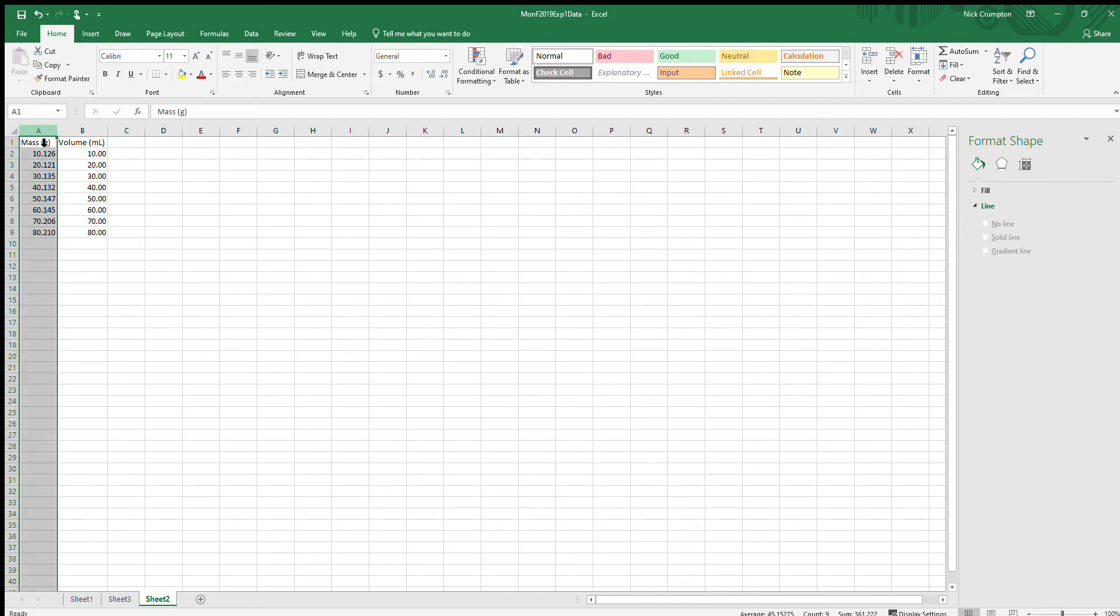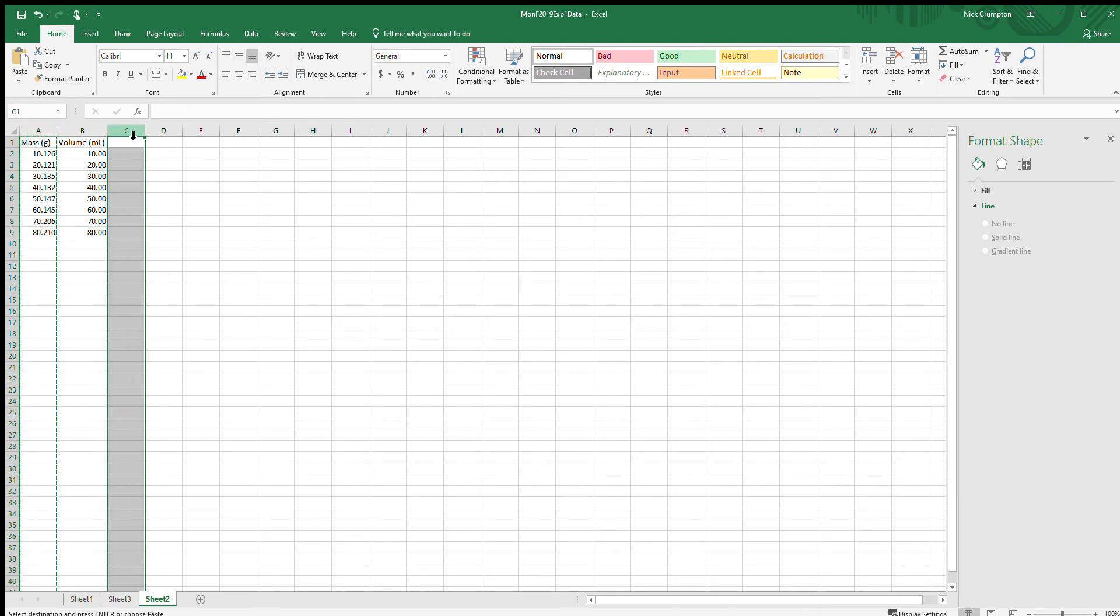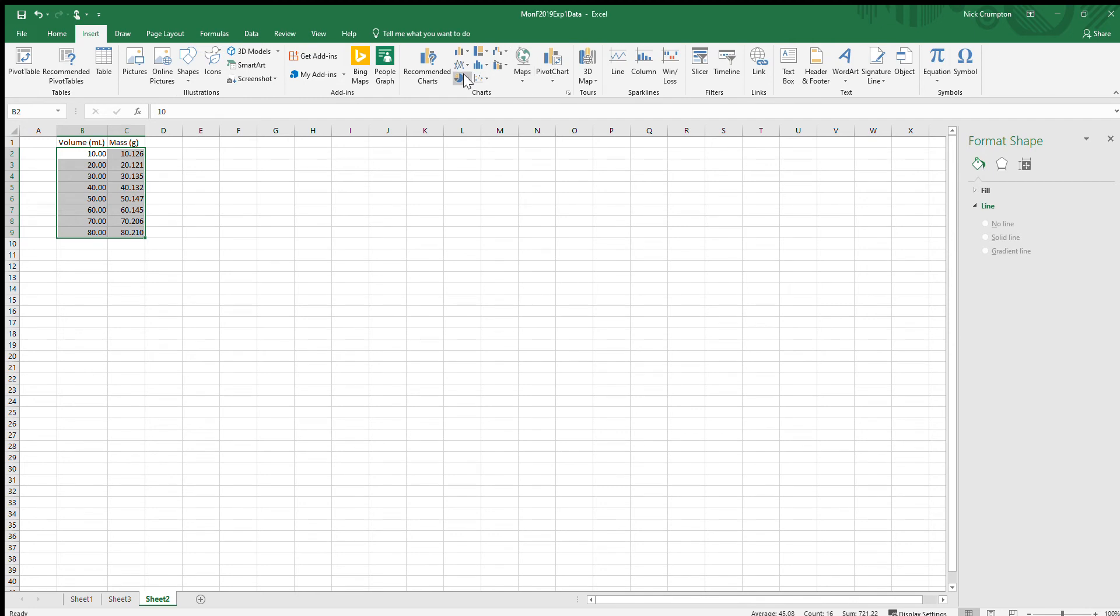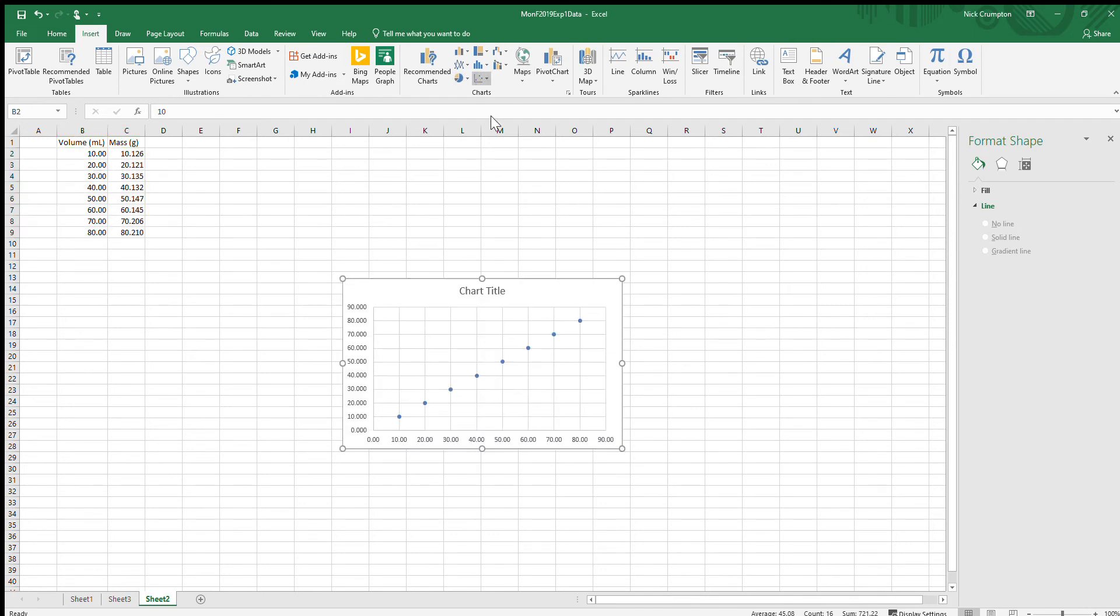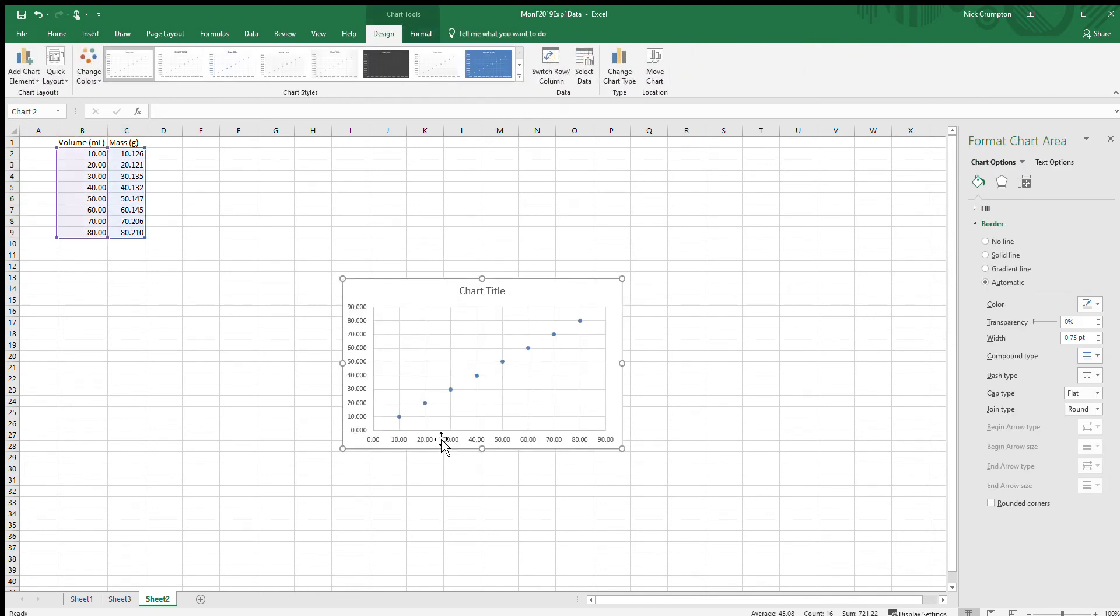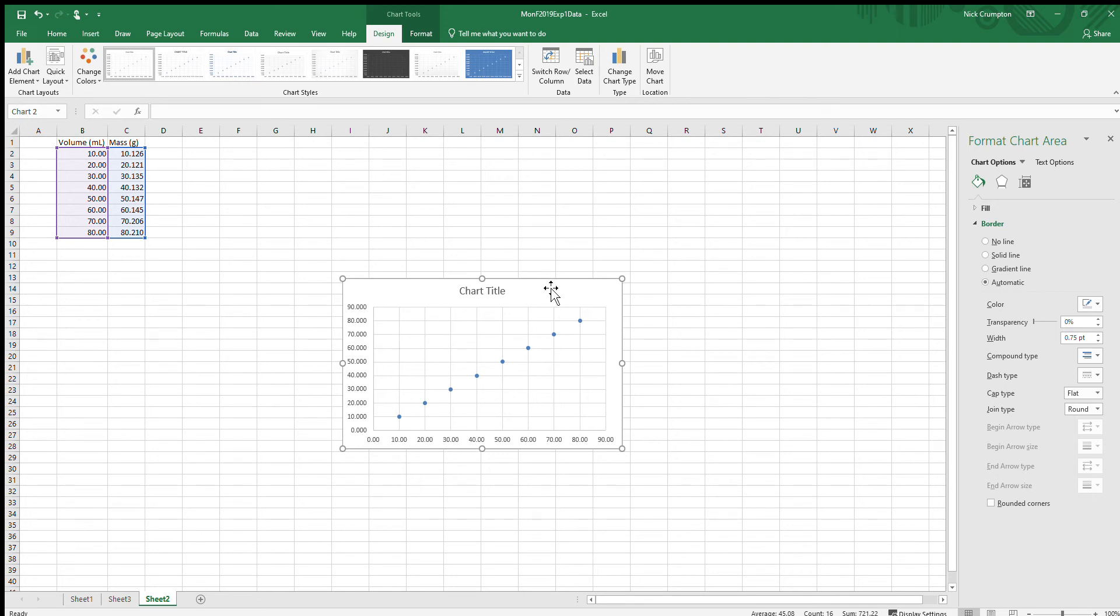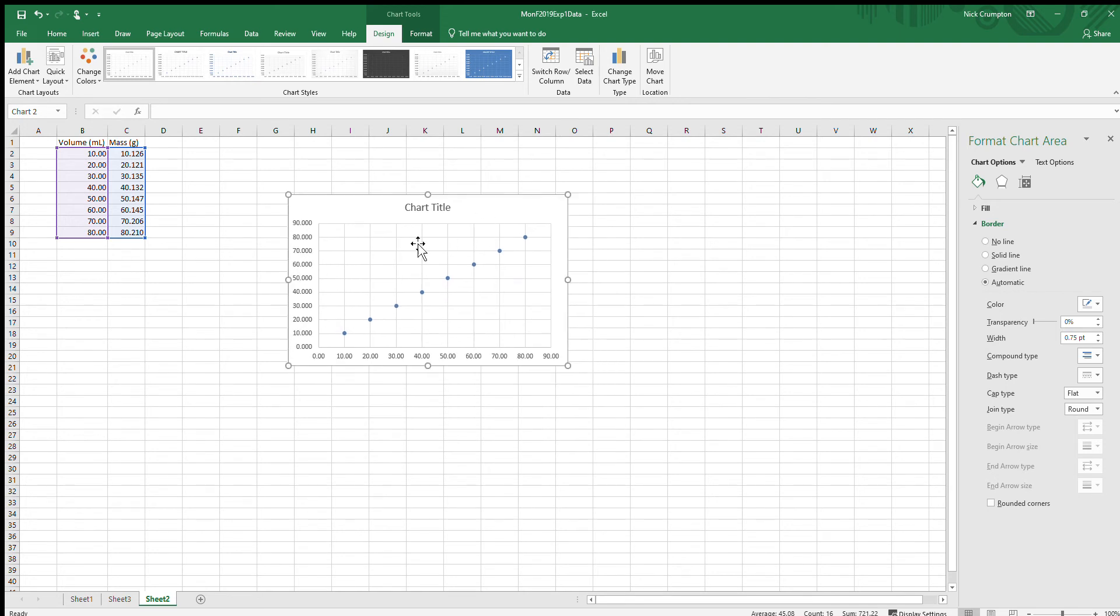I can do a little check here. If I hover over a data point, it should give you the x coordinate and the y coordinate. X being 10.00—that's my volume. The y is the second value listed, which is 10.126. Cool, I did it right that time.